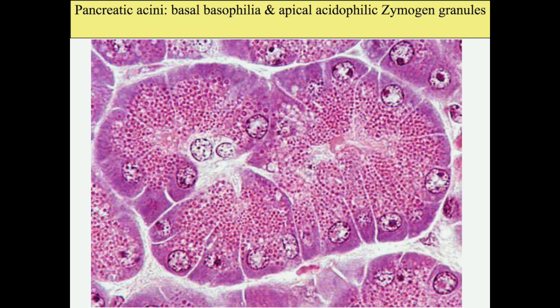This high-power picture demonstrates the features of the serous acinus of the pancreas, where the acinus is lined by pyramidal cells that have apical acidophilic zymogen granules, basal basophilic cytoplasm, and the nucleus is not central — it is rounded, as in a typical serous acinus, but it is basal in position. The boundaries here are ill-defined. The cause of that is the presence of numerous intercellular canaliculi, exactly like that of the cells of the parotid acinus.